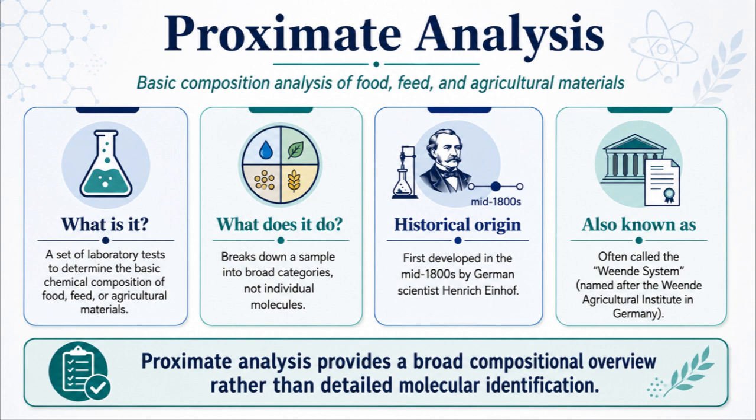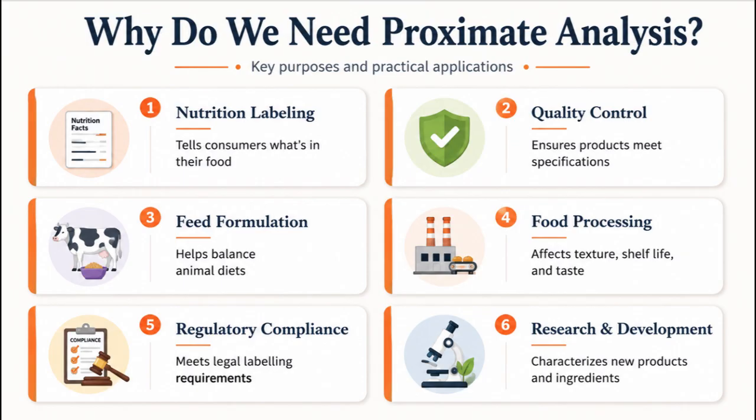It's been used for over 150 years and is still the gold standard for nutritional labeling and feed formulation. Proximate analysis is used everywhere, from your breakfast cereal to livestock feed to new product development. It ensures quality, safety, and transparency for consumers and regulators alike.